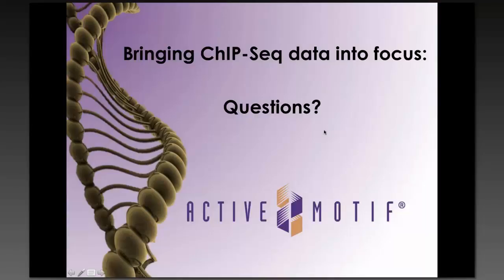And we're mapping separately to the Drosophila genome, counting those tags and making any manipulations to tag counts in the human manually. But depending on how widespread this becomes or how many samples need this, it's something we would certainly be interested in developing to simplify the normalization.